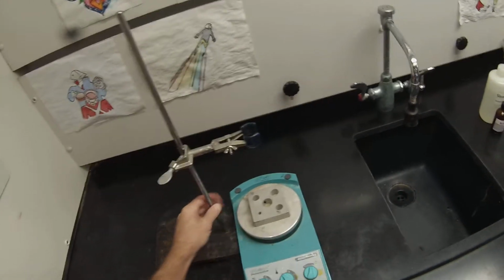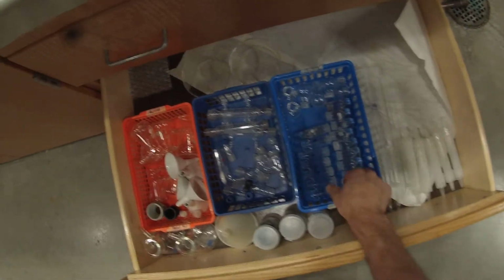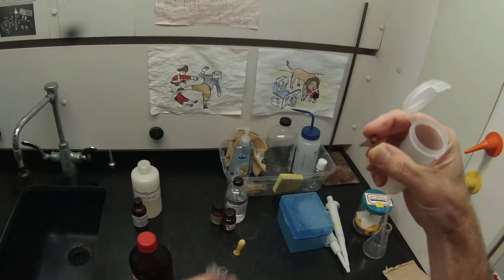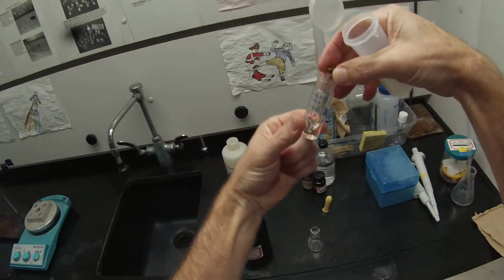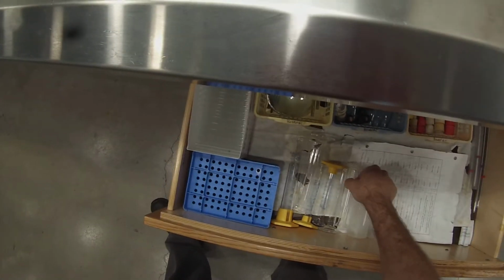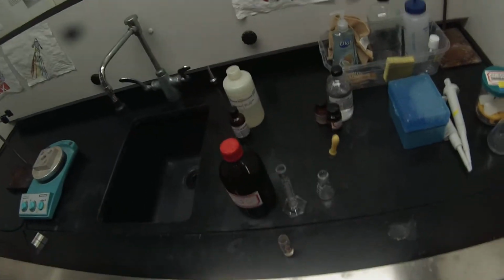Get that set. So we're going to need from drawer D a nice clean 5 milliliter conical vial. And we'll need a spin vane for that, with the pointy end down so it can hit the bottom of the vial. And we'll need a graduated cylinder for measuring the concentrated acids. You would normally be getting those concentrated acids from a burette, but since we don't have that set up, it's not worth setting up a burette just for one.